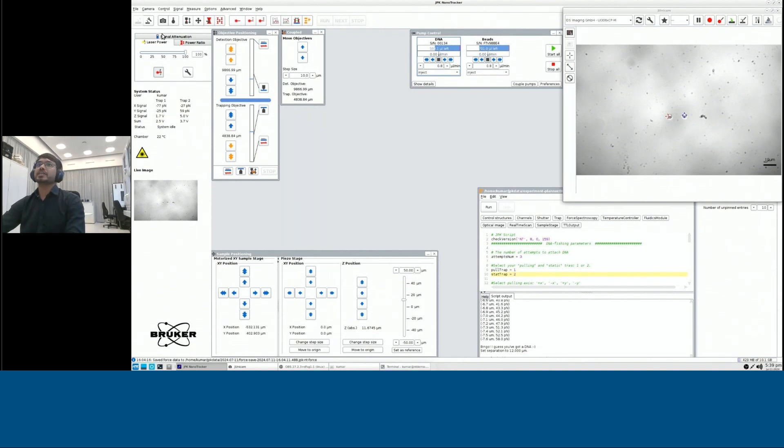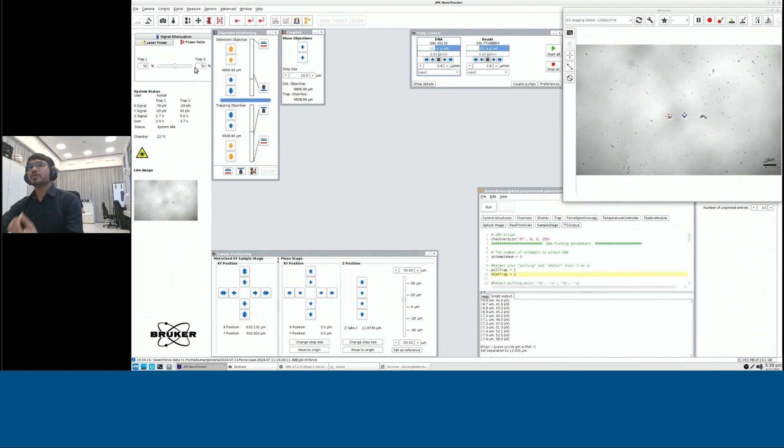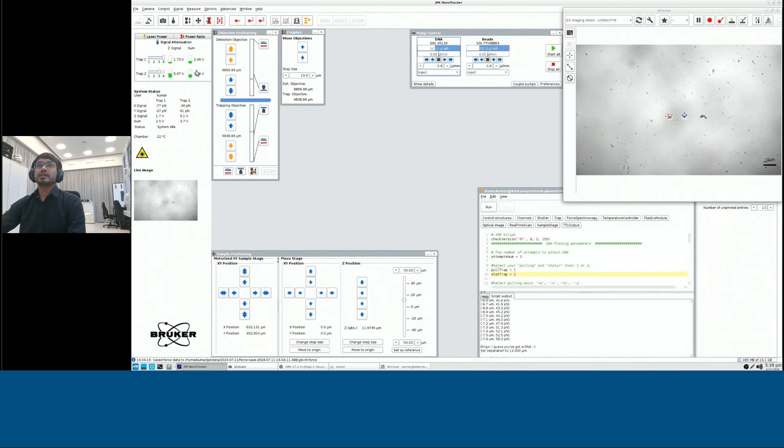So on the left hand side, you could see the functions where you could set up your laser power, as well as we have two traps here. So we could distribute the power, how much power you want in each trap. There are some attenuation filters right before the detections, so that you don't want your detection to be oversaturated and you could use one of the filters.